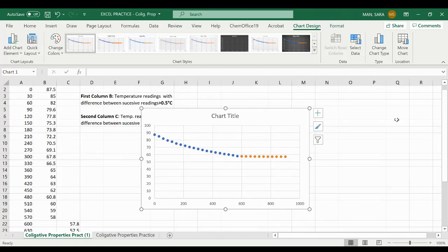Now, the plot will not mean anything if it's not properly labeled. This is just for your future. Maybe they will accept it for this report, but if you get the habit of labeling it properly, it will help you a lot. Also, look at the scale.